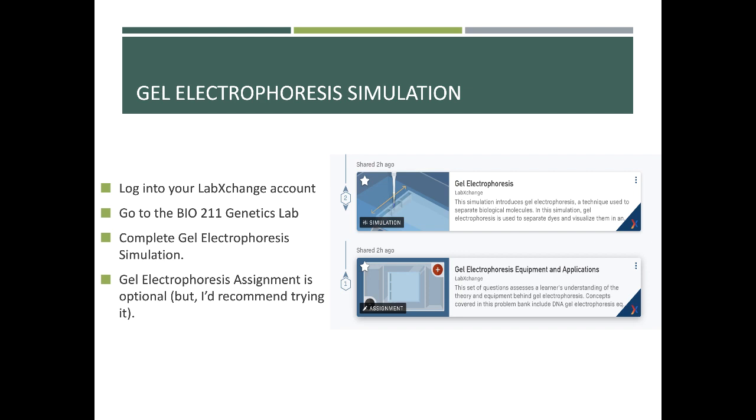One of the steps has you put the tubes in a centrifuge. And the step reads put in a centrifuge, and it's correct. You need to put them in a centrifuge. However, I couldn't find the centrifuge. It was nowhere in my visible view of the simulated lab bench.